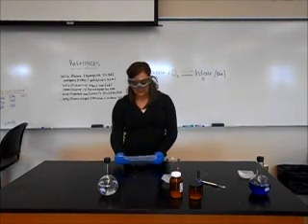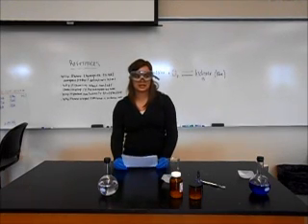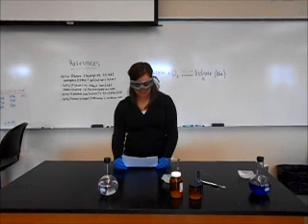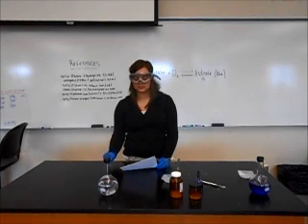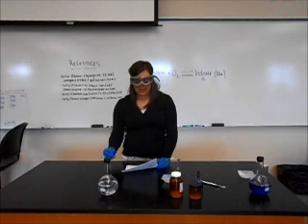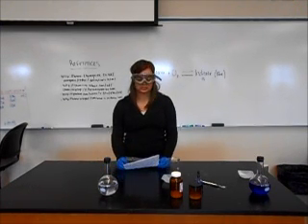And the reaction that takes place is called a redox reaction because it has reduction and oxidation both happening at the same time. And the reduction is the loss of oxygen that occurs when the dextrose takes oxygen out of the solution. And then the oxidation occurs when you shake it and it turns blue because oxygen is reintroduced into the solution.